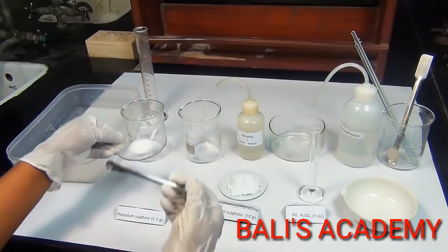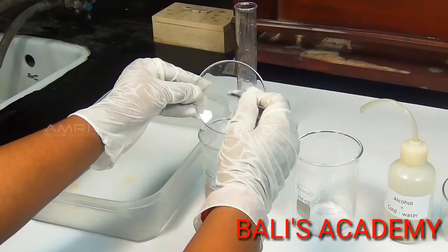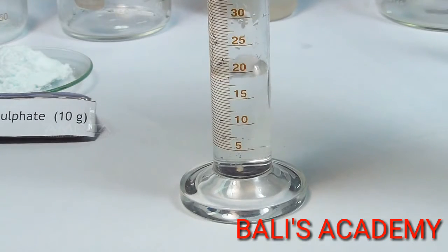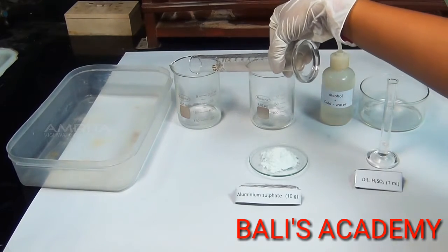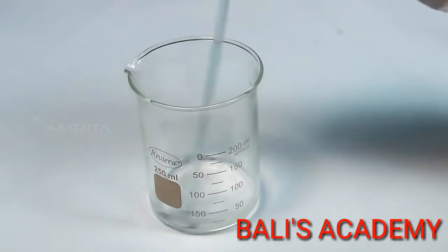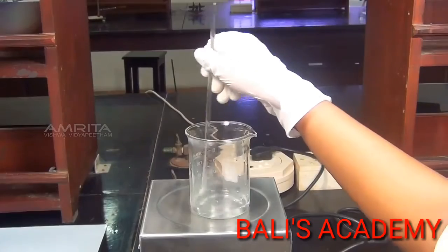Take about 2.5g potassium sulphate crystals in a clean 250ml beaker. Measure about 20ml of distilled water in a measuring jar and pour it into the beaker containing potassium sulphate crystals. Stir the solution using a glass rod to dissolve the crystals. If the crystals do not dissolve, warm the solution to dissolve them.